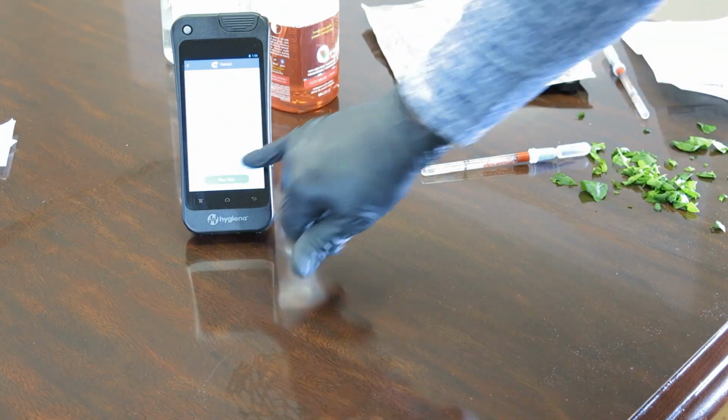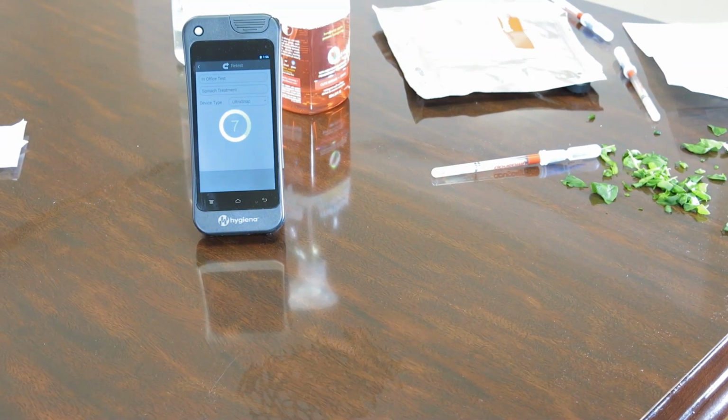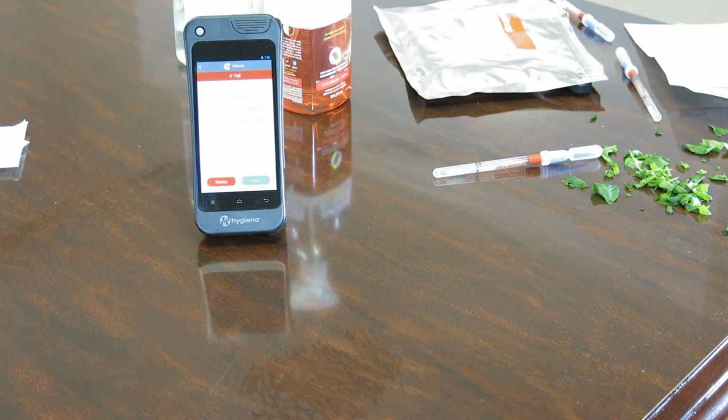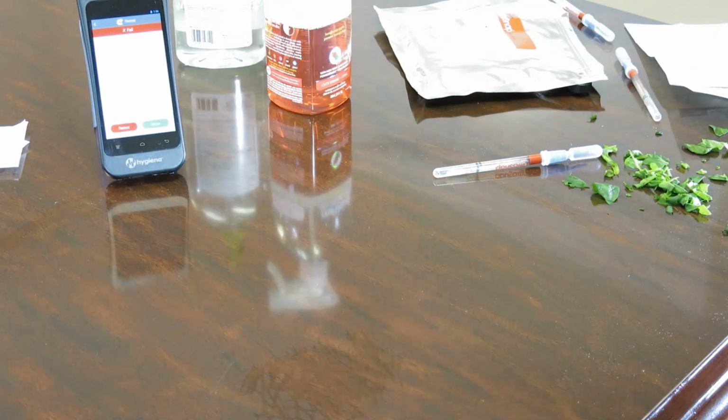Okay, we're still at a fail with 97 RLUs. Let's give this one more good clean. Hopefully that'll take care of it.